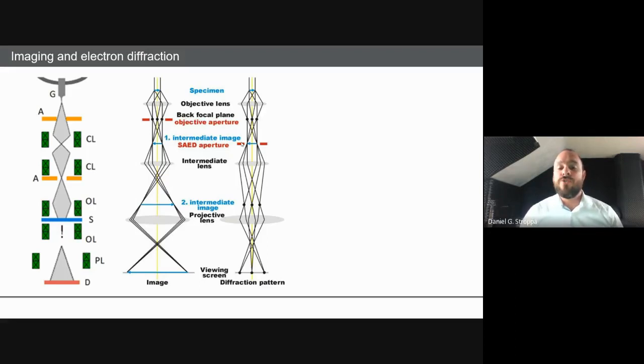And this is how a diffraction pattern looks like. This is the first diffraction pattern that I acquired. It was there in the synchrotron lab, and it was recorded on a film. So that's why there is an inverted contrast. If you acquire this in a camera, that's the common practice today, it looks inverted.